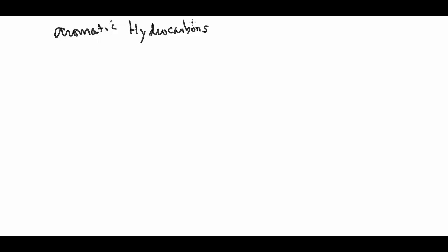Now there is, of course, fragmentation. There are two fragmentation routes that I would like to discuss. Alkyl substituted aromatic compounds tend to yield benzylic type carbocations.